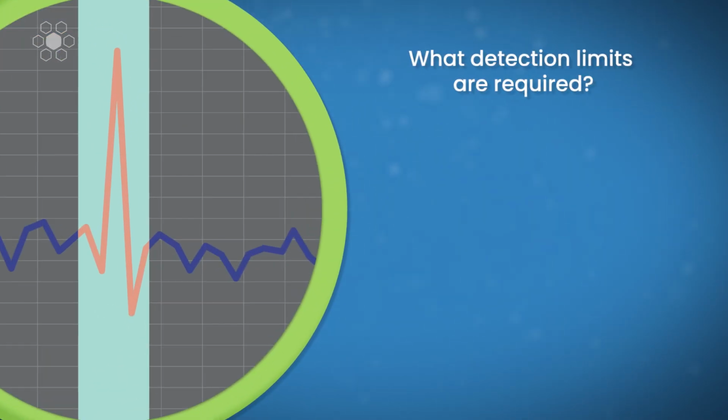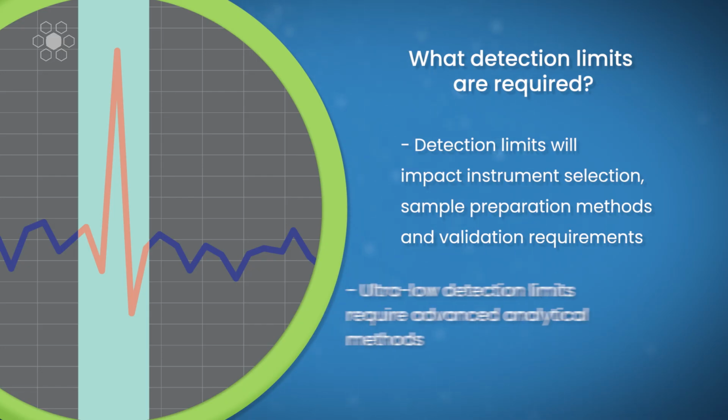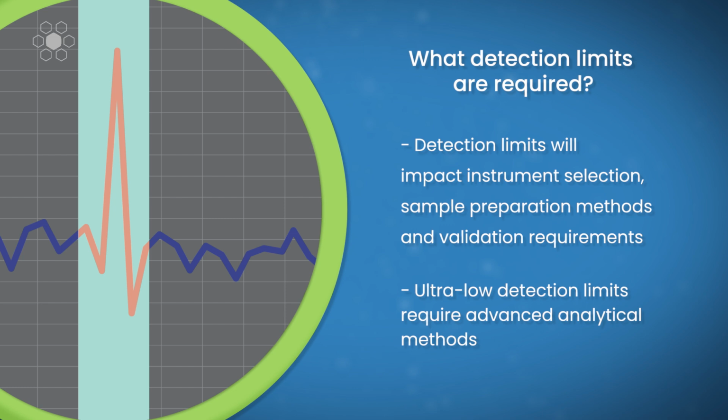What detection limits are required? The selection of instruments, together with sample preparation methods and validation requirements, will depend on the detection limits needed. The achievement of ultra-low detection limits requires advanced analytical methods that demand significant resources.